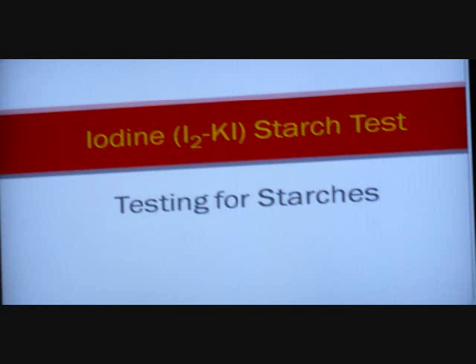Now, what that means, that's an unusual structure for a formula. That's elemental iodine with potassium iodide. That's taking iodine like from the element. So there's a name for that. And when I asked for the iodine, I wanted Lugol's iodine.